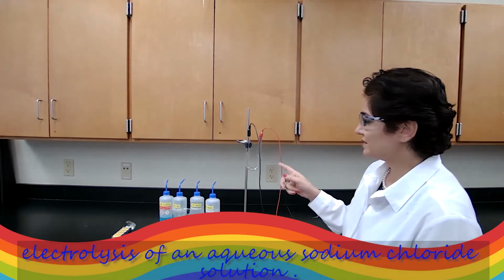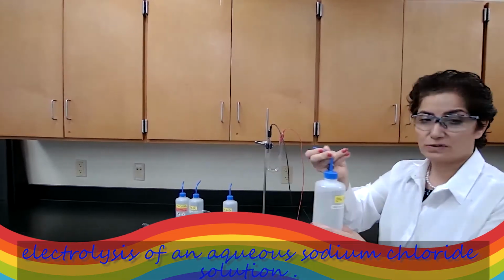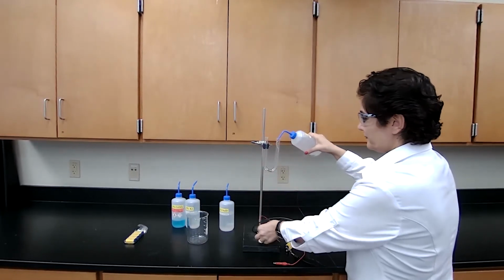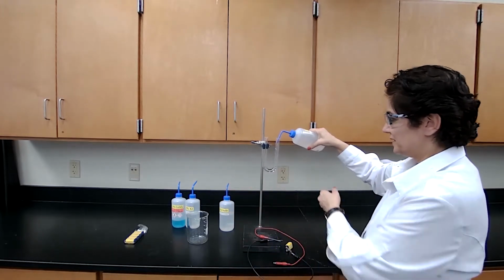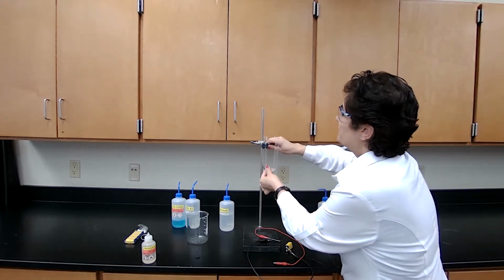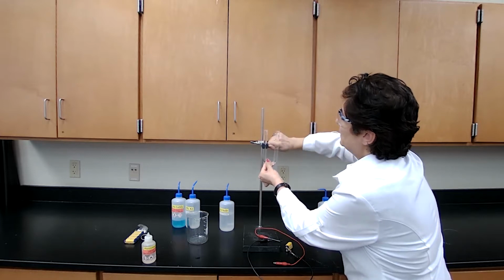The first solution to be analyzed is sodium chloride. So we are going to use a 2% sodium chloride solution to fill up the tube. And if I can please have the phenolphthalein. I'm going to bring it up, so if there is a color change, you could see it more easily.